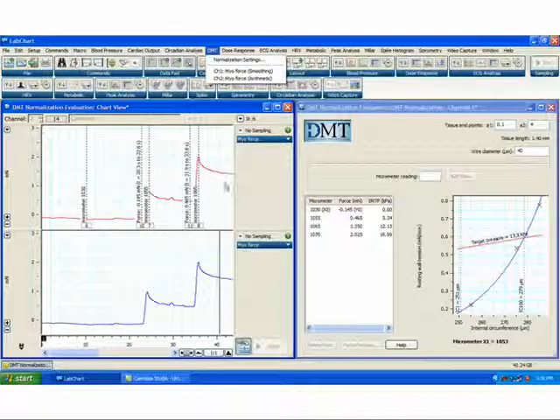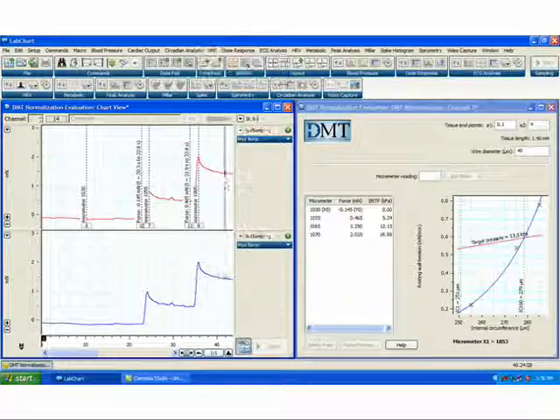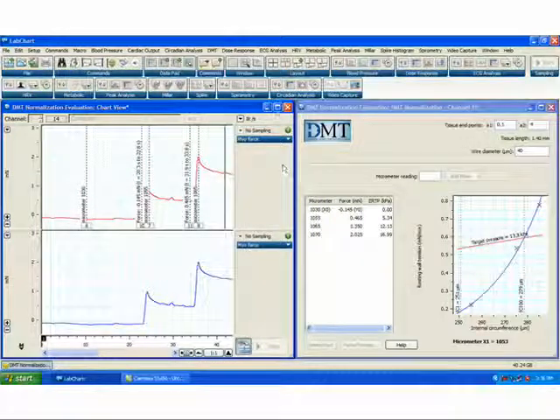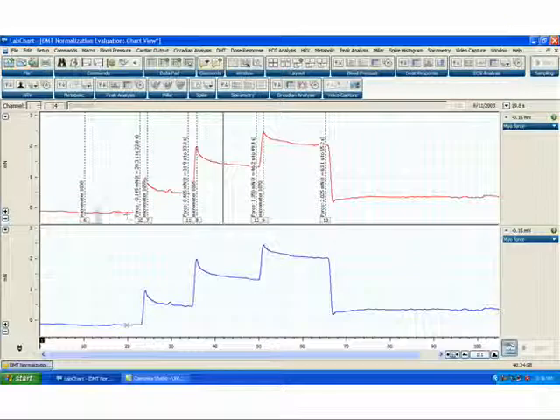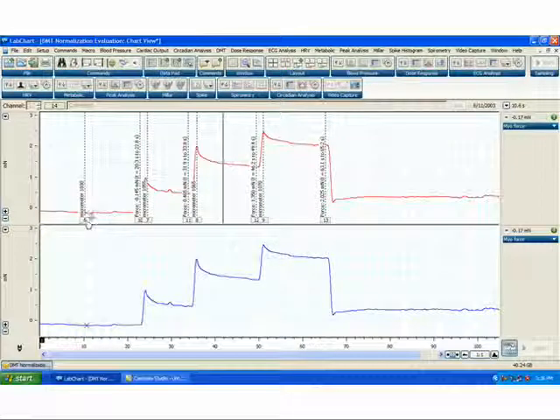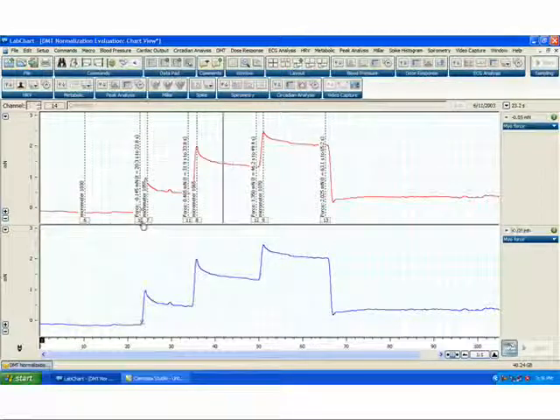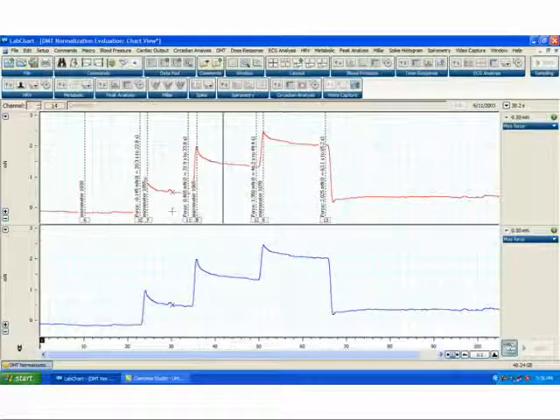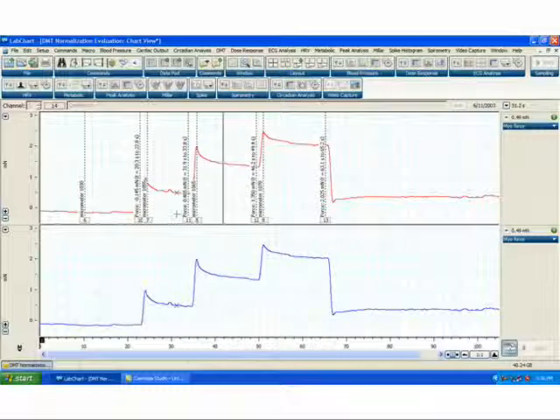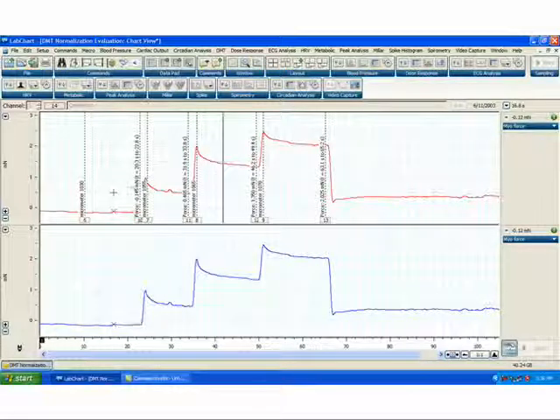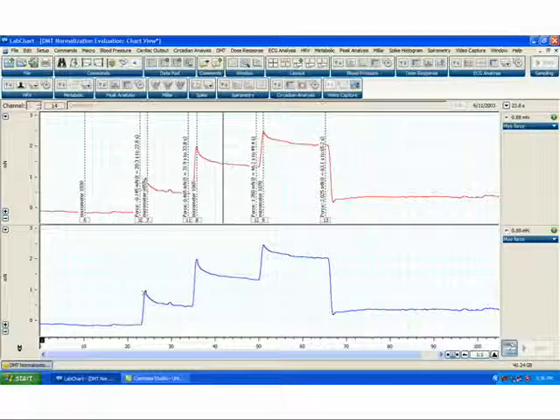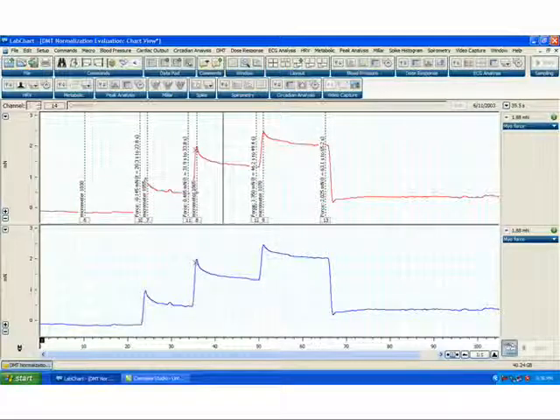Data for the DMT normalization module is obtained by increasing the micrometer setting stepwise and then recording the resultant force signal in your chart window. Here we see the resultant force from increasing the micrometer setting from 1030 to 1055 to 1065 and finally to 1070.